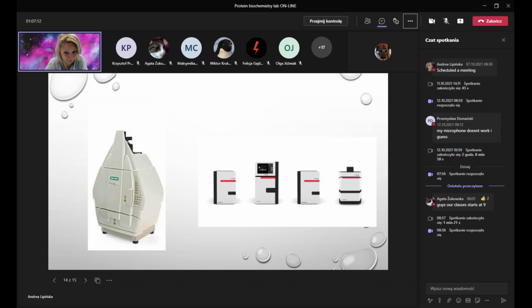Sometimes we cannot use milk. Can you think about the situation when we cannot use milk as a blocking reagent? For example, if our protein has an affinity to some proteins in milk? Well, our protein will not jump from the membrane, but our antibodies may have affinity to milk proteins. For example, sometimes for His-tagged proteins, in milk there are proteins with polyhistidine, and they are recognized by some antibodies. But generally, for His-tag detection, milk is not recommended as the blocking agent.